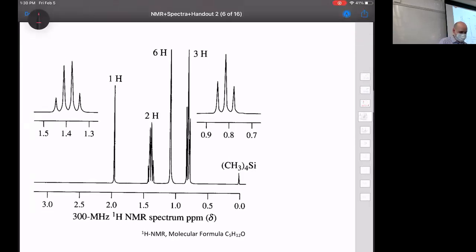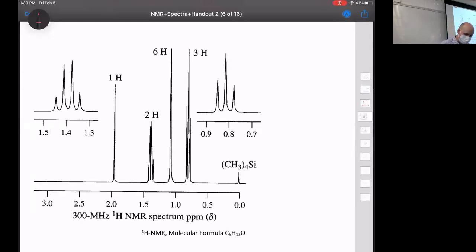All right, so this molecule has 4 signals. It also has this thing at 0. This is the little molecule that we add in order to have kind of a blank to have a 0. So this is not a thing you need to interpret. Instead, this molecule right here has 4 peaks, so 4 signals, so 4 hydrogen NMR environments. Yes, we're skipping back to hydrogen NMR. And there's a lot of information. And you can use this information, and I've given you a molecular formula, to figure out the entire structure of the molecule.